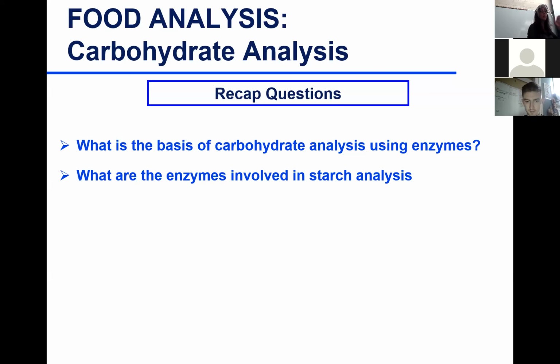And yes, to Dan's point, sometimes we need to do coupled reaction, sometimes just one reaction. The coupled reaction would be the first reaction did not give me a product that is a chromophore, but can be reacted with another component to give me a product that I can measure that is a chromophore.